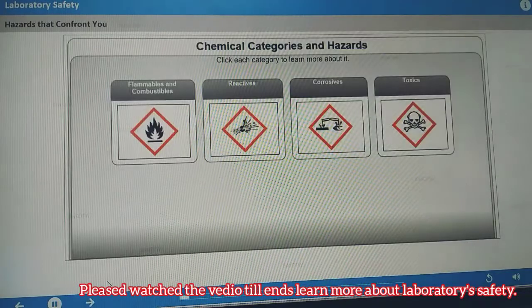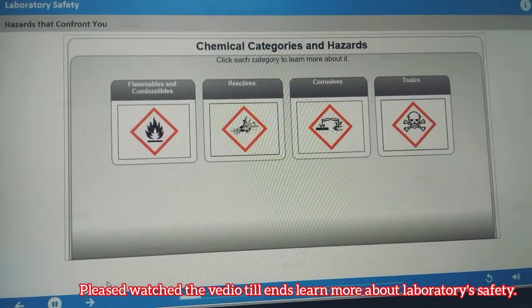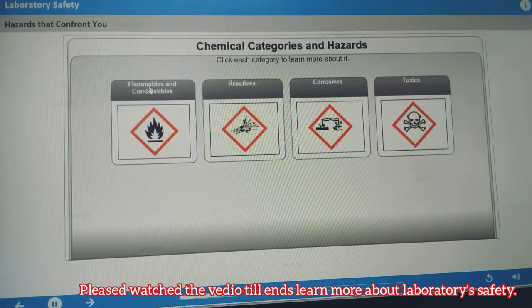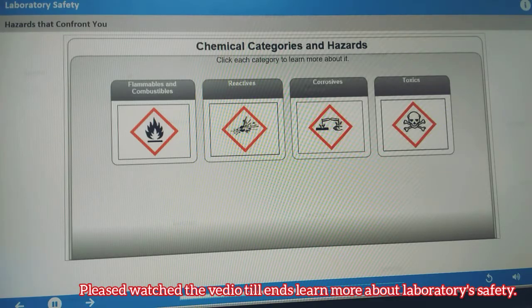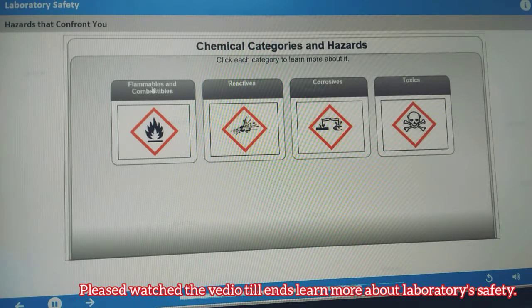There are a variety of chemical properties that can lead to physical or health hazards. Flammables and reactives are most closely associated with physical hazards, and corrosives and toxics with health hazards. Be aware that some chemicals, such as corrosives, fall under multiple classifications.